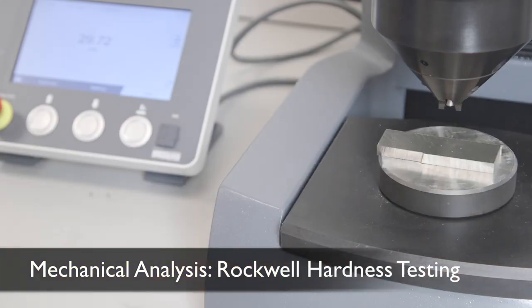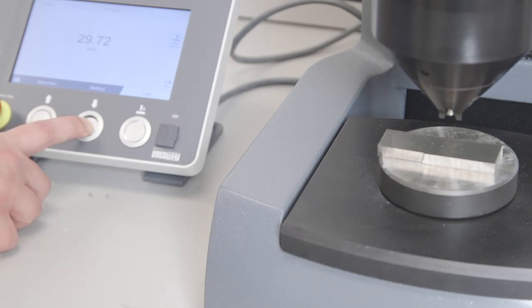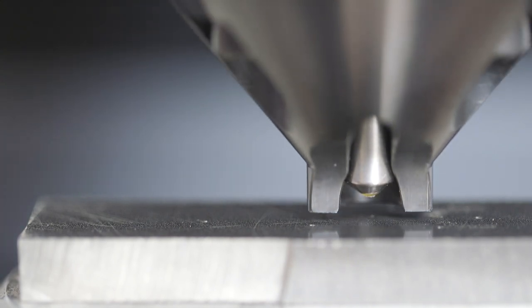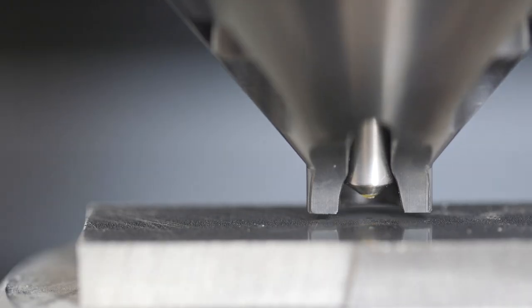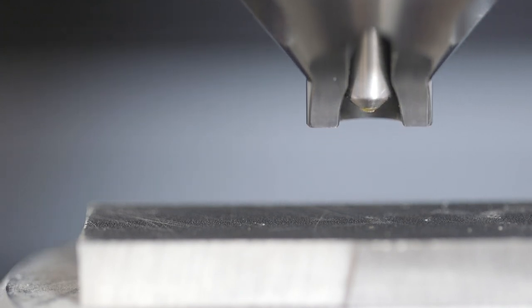Here we are performing Rockwell hardness testing. It is a macro test to quantify the relative hardness of materials. It uses a diamond tip with a certain load and measures the indentation depth into the material to distinguish the hardness of the materials.